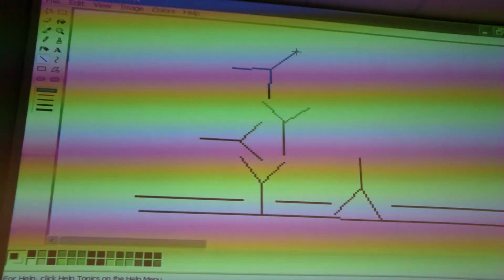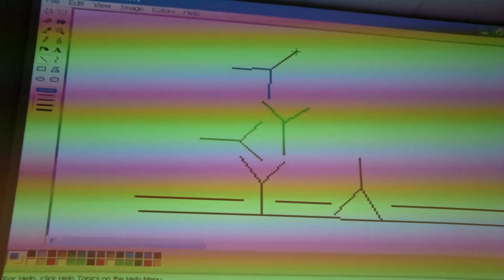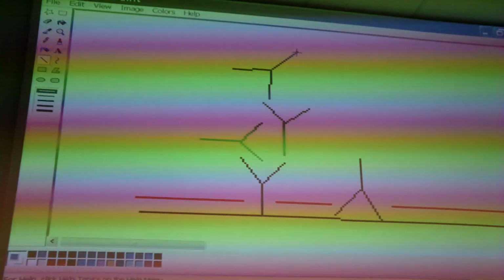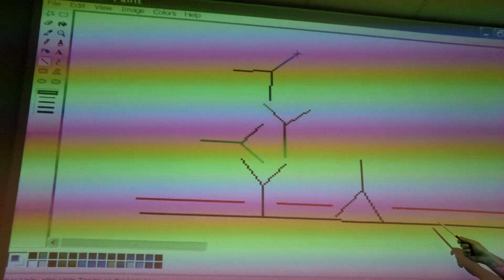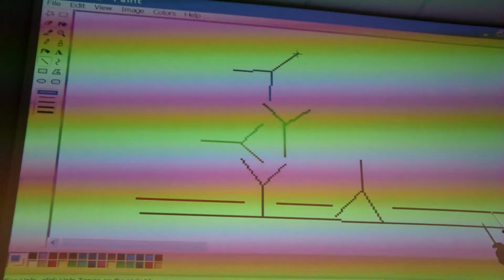So then I guess that the second antibody, the blue one, doesn't matter which way we put it. Can we say this? Yeah. Because it cannot bind any other antibody, because there is no other antibody. You can only bind the right ones. So it cannot bind to the plate, of course, because it's blocked with BSA.